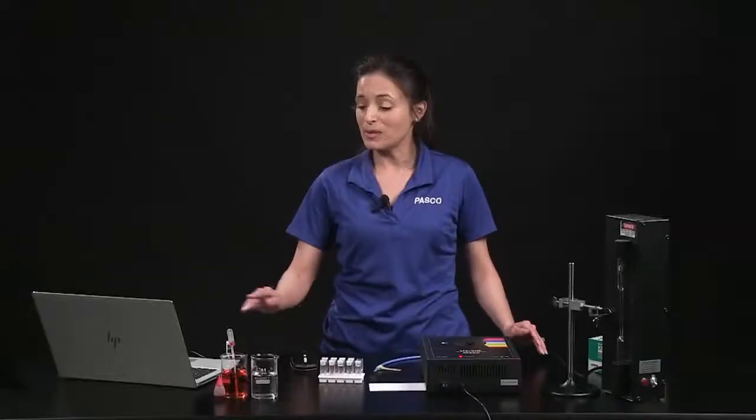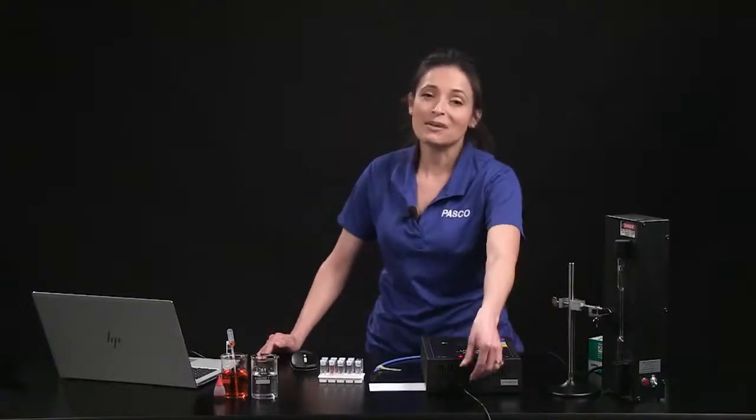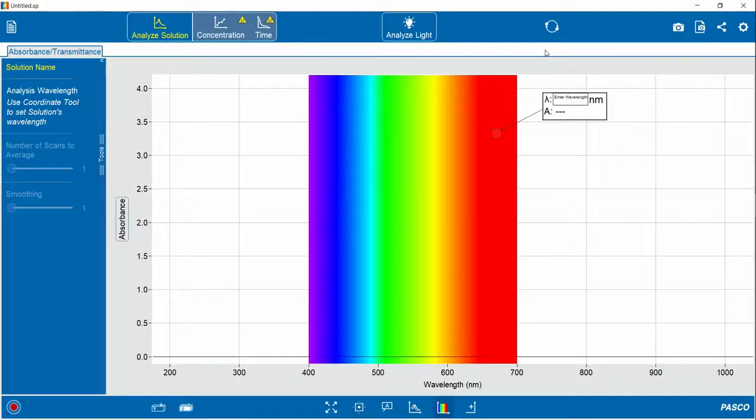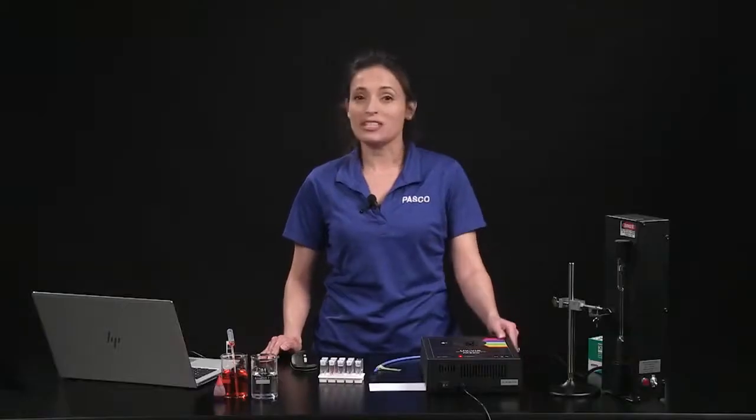The spectrometer connects via USB to your Windows or Mac computer. It comes with an AC adapter.